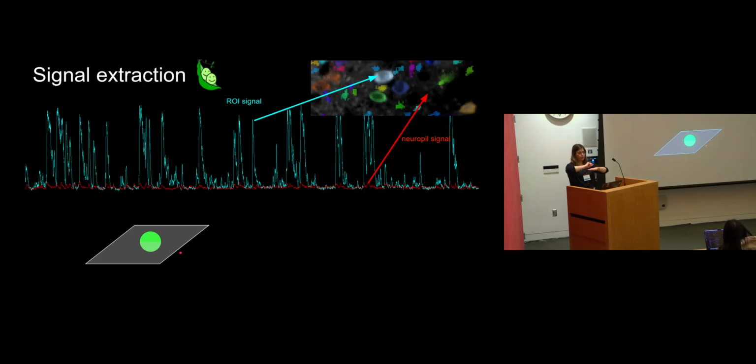What's really nice about two-photon calcium imaging is you're doing this raster scanning, and you're very precise at where you're exciting in XY, but your point spread function, so where you're exciting in Z, is actually not so narrow. So this point spread function is quite narrow in XY. You see it's small here, but in Z, it's quite elongated. So when we're exciting this plane in XY, we're also exciting processes above and below the cell that we're imaging.